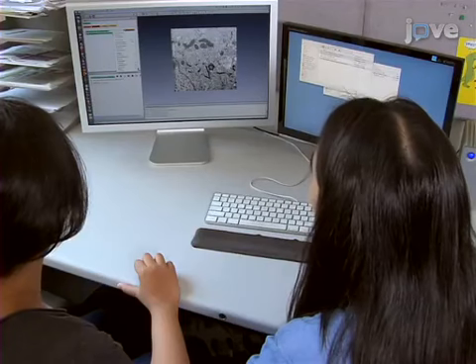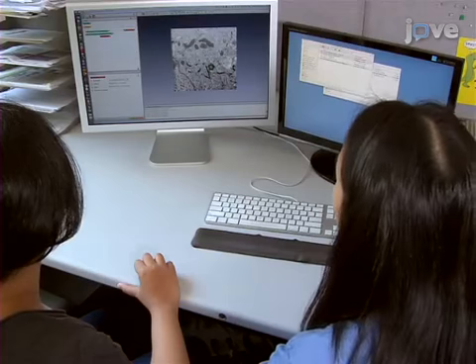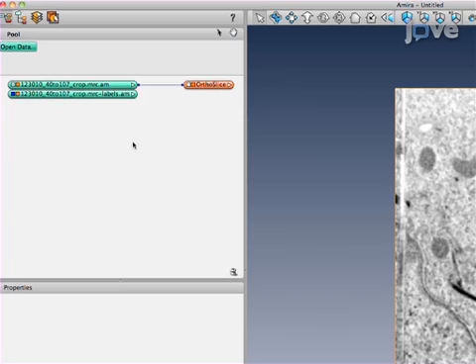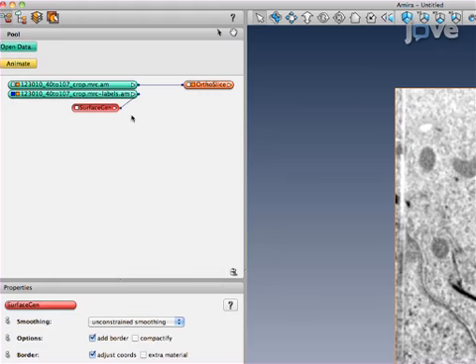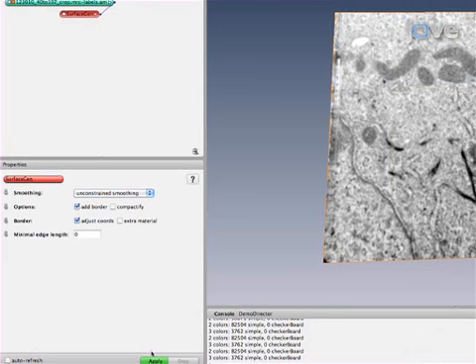Generate a surface rendering for visualization and basic qualitative or quantitative analysis per software user guide instruction. In the Object Pool tab, toggle the file name labels.am in the Pool window. Then right-click and select Surface Gen. Select the desired surface properties and click Apply.